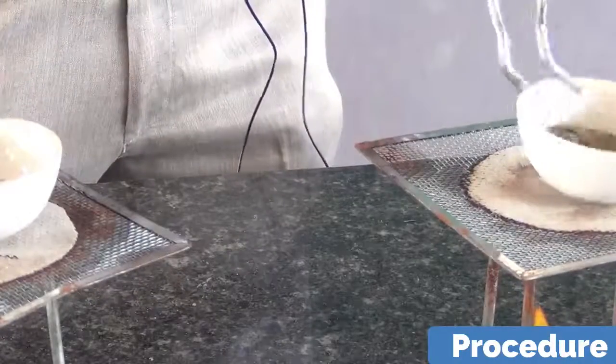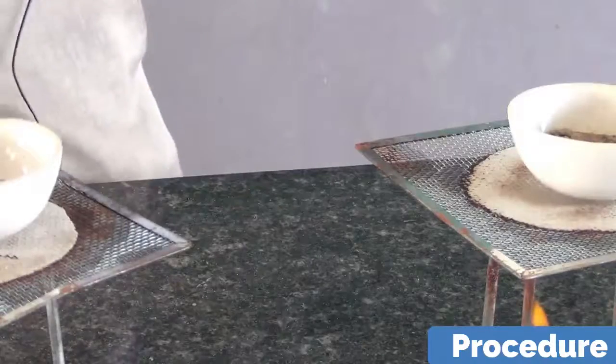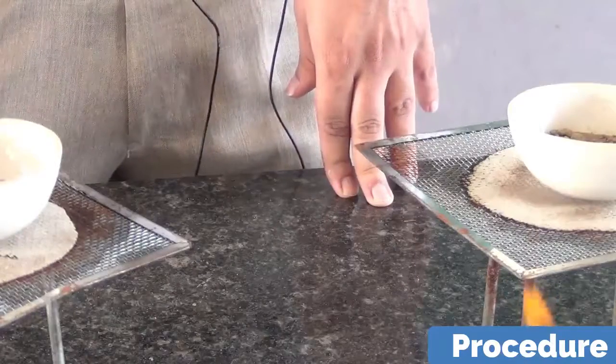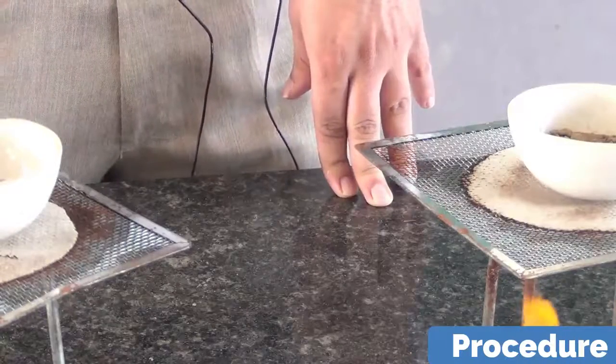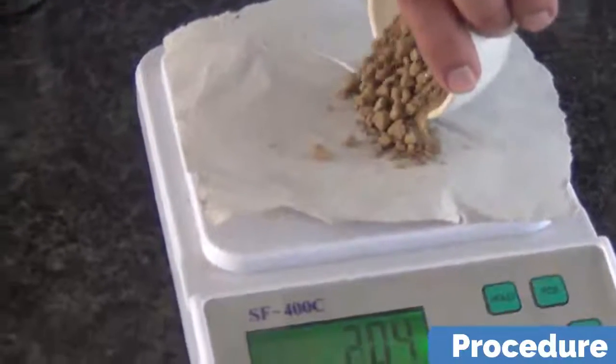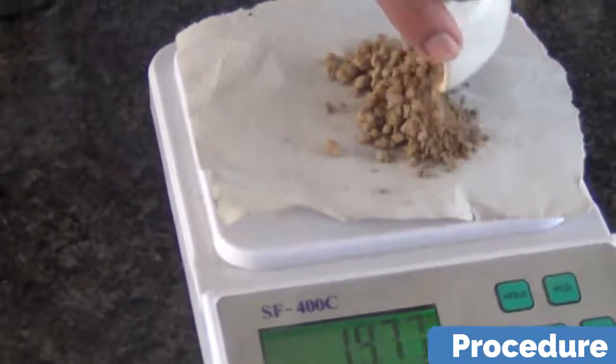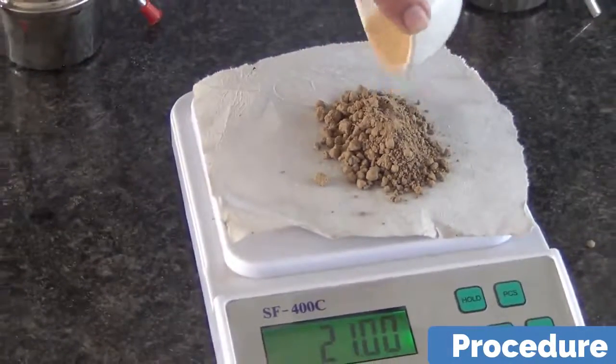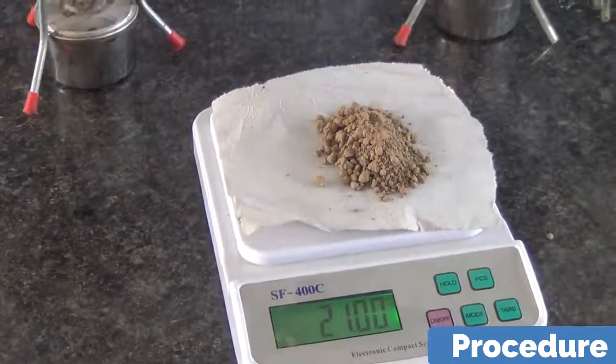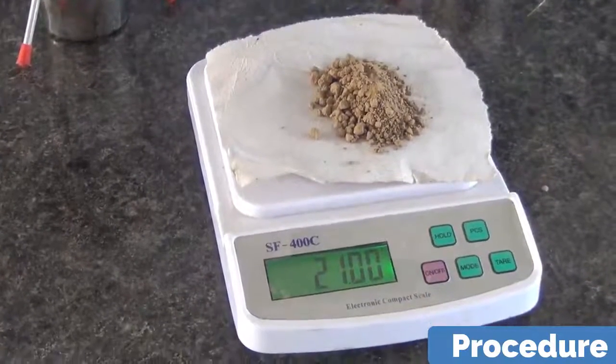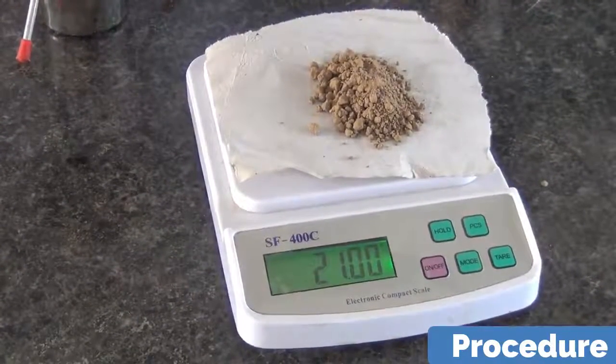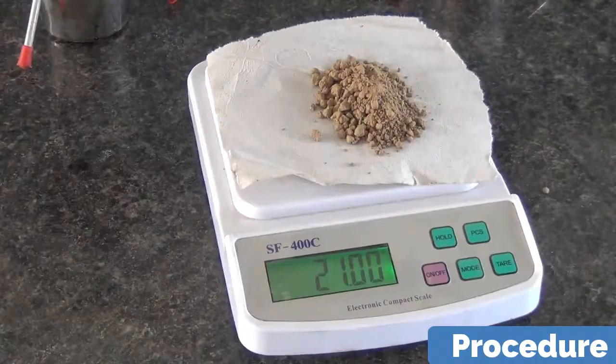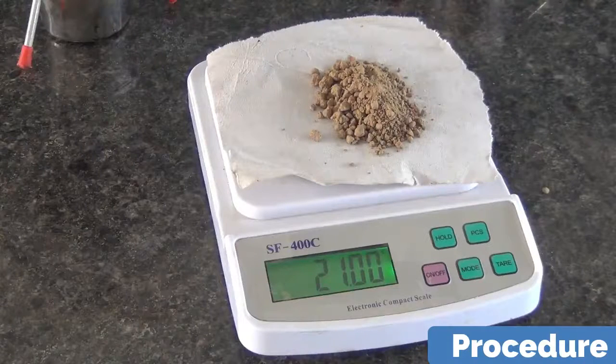Now we are going to weigh on the digital balance and find what amount of water was evaporated. For loamy soil, we are going to weigh the soil. And you observe the total weight. The total weight comes out to be 21. So we have to write this on the board.